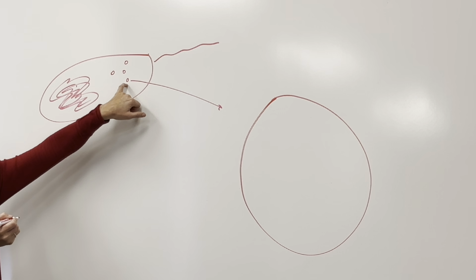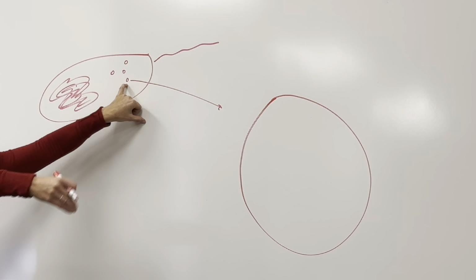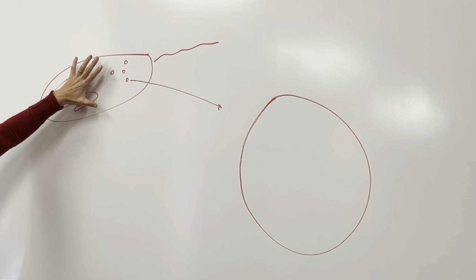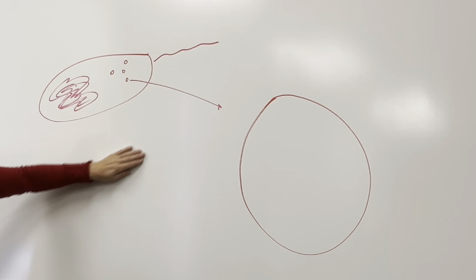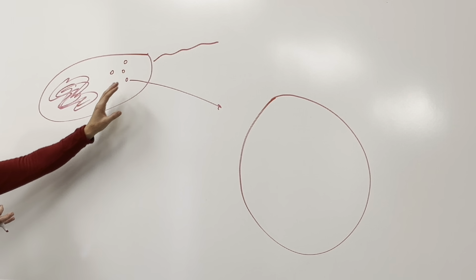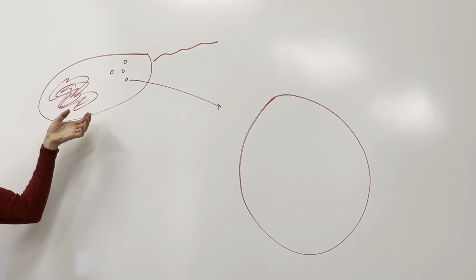It usually gets in there in nature because of conjugation, because that plasmid will form a sex pilus. With the sex pilus, the plasmid is transmitted bacteria to bacteria. But we're going to transform, which can also be done in nature. For example, when a bacterium dies, all its plasmids are circling around where there's E. coli everywhere. Those E. coli that are standing around, if they're competent, can take up plasmids from the environment. That happens in nature also.